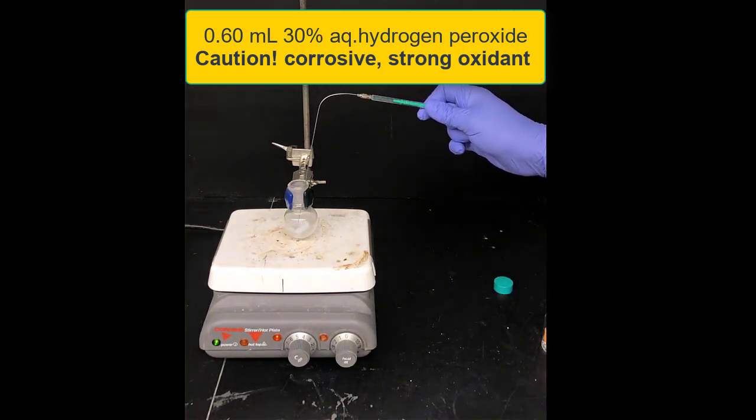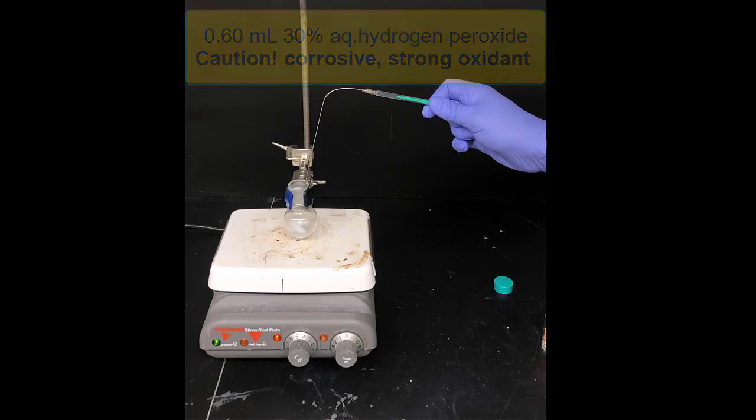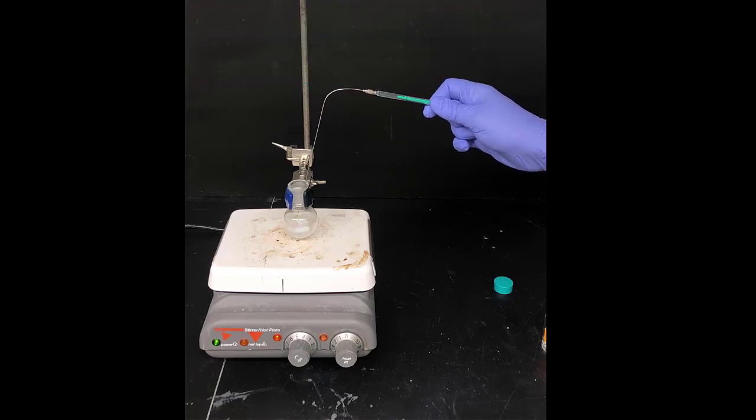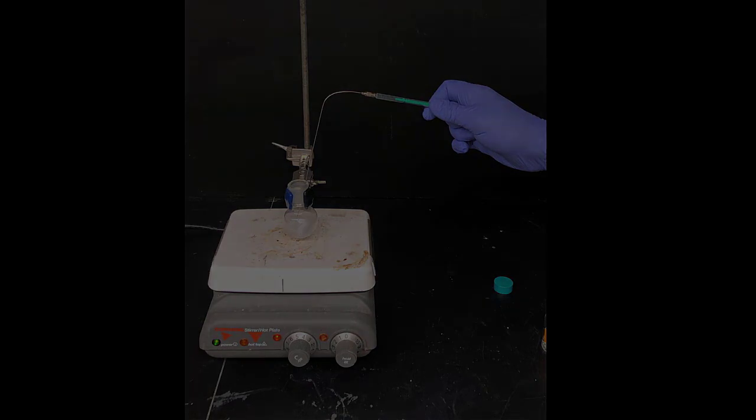Draw up 0.60 milliliters of the 30% hydrogen peroxide solution in a syringe and needle. Be sure to use a clean syringe and needle and add that to the reaction mixture slowly over 10 minutes with stirring. The idea with adding it slow is that the reaction won't overheat prematurely.